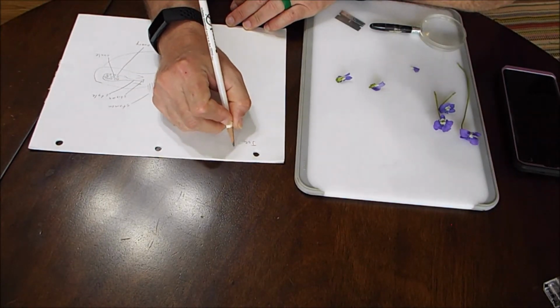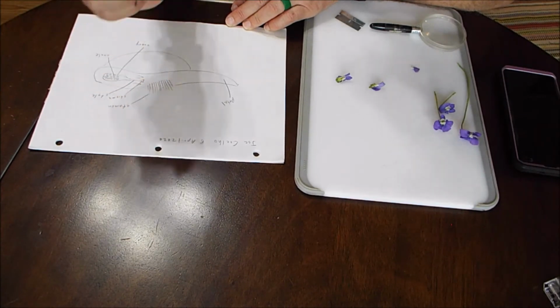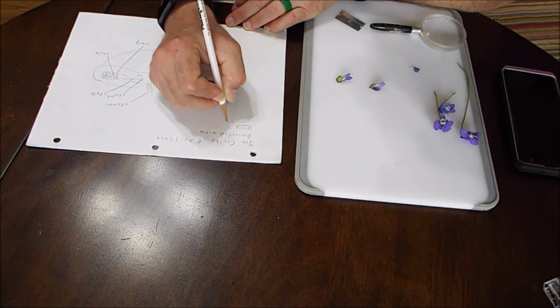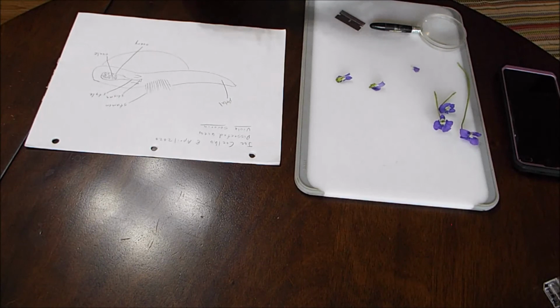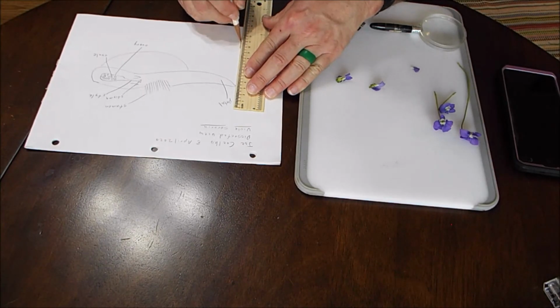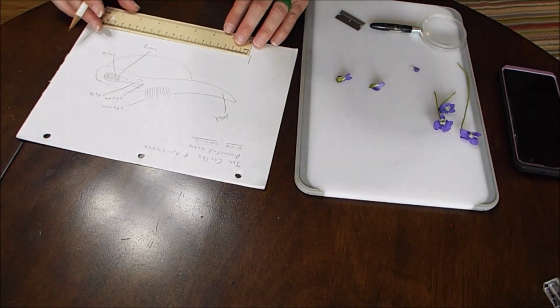And to finish it up, gotta have our critical information here. An unambiguous date, right? And this is dissected Viola sororia, and now we need to do the scale again. So if I'm looking at the whole thing, it's about 2 centimeters across. So again, if I do the trick where I draw a line there, I'm going to be smart this time and draw just a very faint line there, measure them.